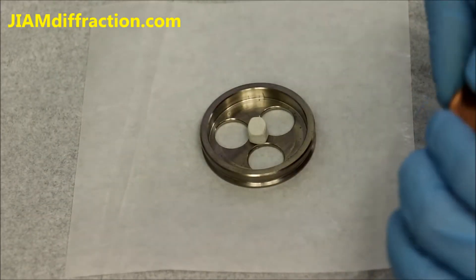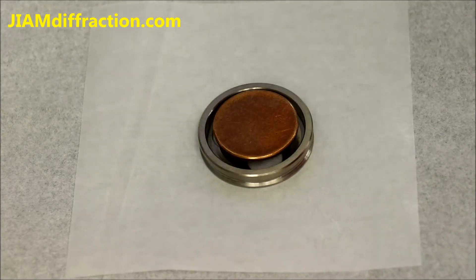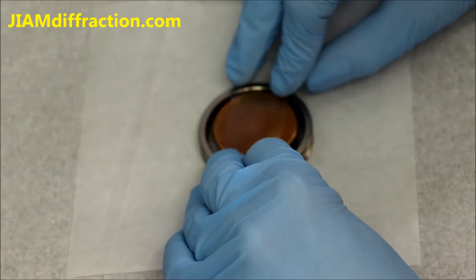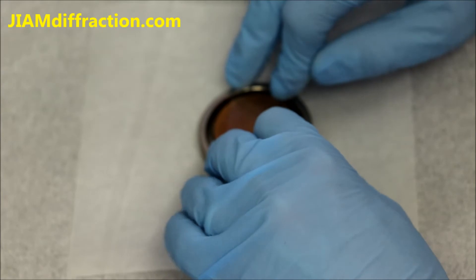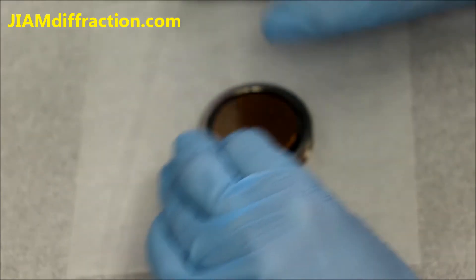We then take our sample, place it in the center, take our glass slide and press down again. I recommend pressing down rather slowly because it's easy to break these glass slides, especially if you have a smaller sample.